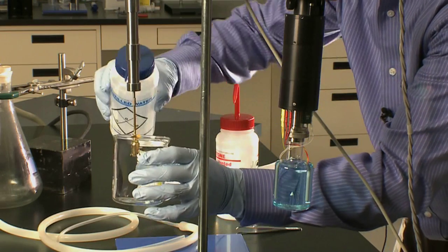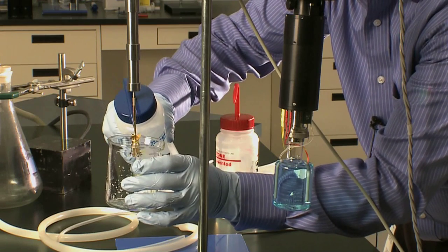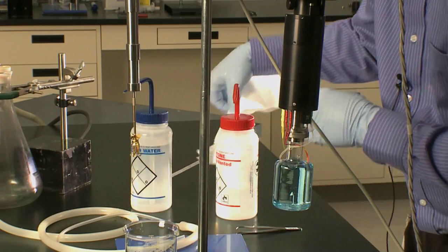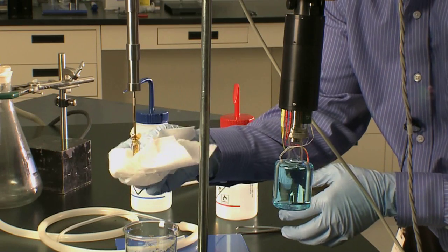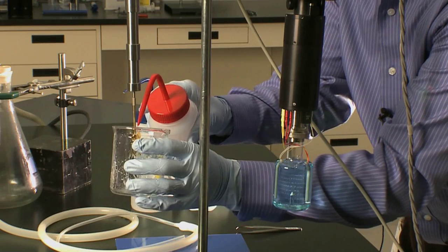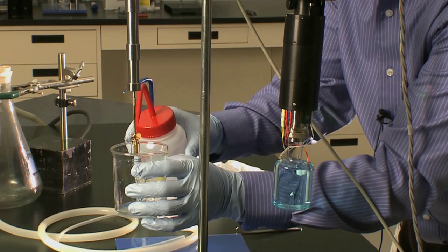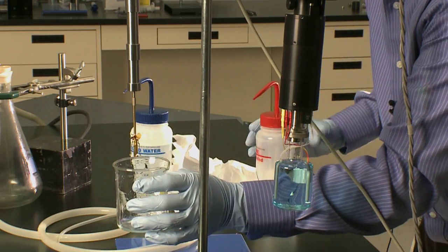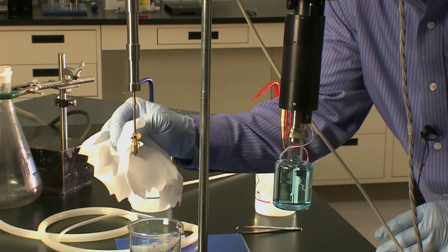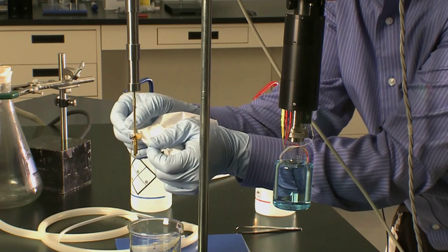Rinse off the stirrer with water, maybe followed by acetone. Dab it dry, then follow up with some acetone to fully dry the stirrer. Make sure that no glass fragments remain on the stirrer for your next experiment, and that the stirrer is completely dry before your next experiment.